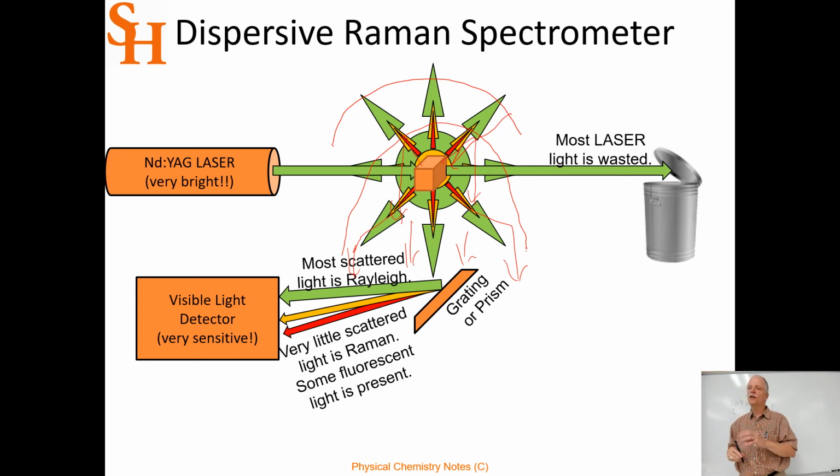Yeah, and so that's where the cost comes, because these optics are all reflective and they've got to be precise. So the precision of the optics will really jump up the cost. That might be a $300 or $400 little collection piece, or depending on the company, maybe $3,000 or $4,000. Some of them are proud of their optics, and maybe rightly so.